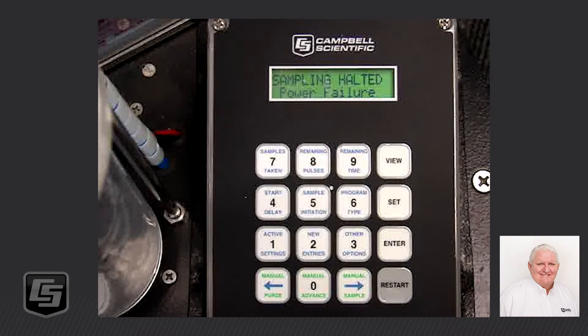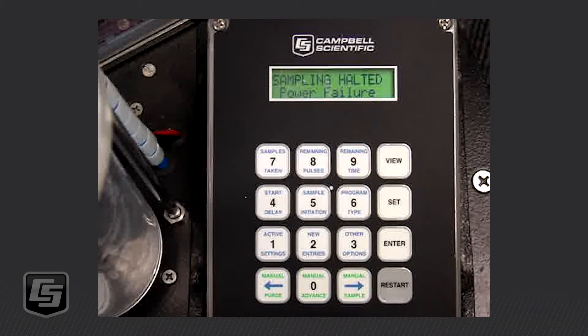Hello, this is Ron at Campbell Scientific. Today I'm going to walk through how to program the 16-touch keypad for a start delay of a time/day program with intervals set at 15 minutes on a composite sampler.